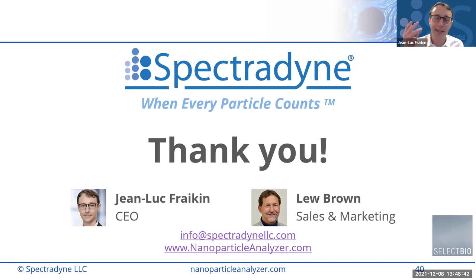So that was 3 questions. And the 4th one is about which solvents are acceptable. By the way, all this information is on our products page on our website. But there are 2 requirements for the sample diluent. One is that it be conductive. Generally that means aqueous solutions with some kind of conducting ions in it. And the second is that there needs to be some wetting agent in the sample to help it get into the cartridge properly.